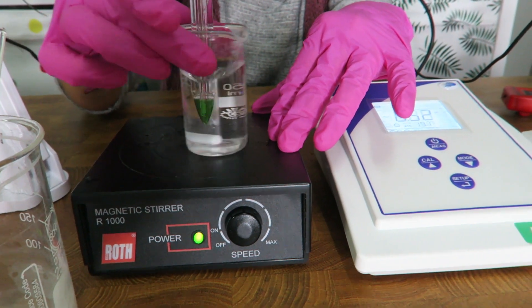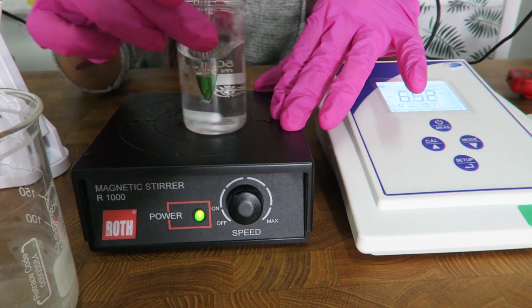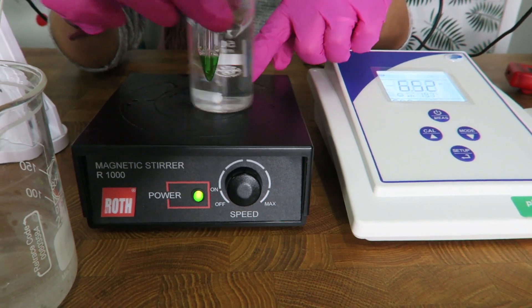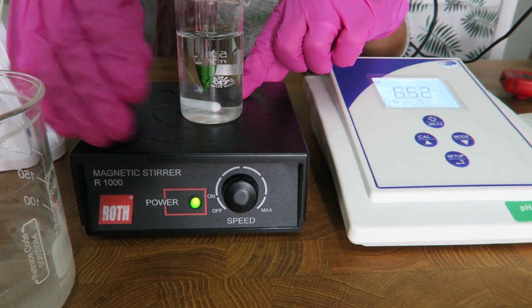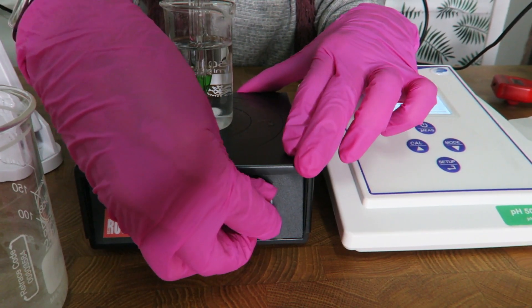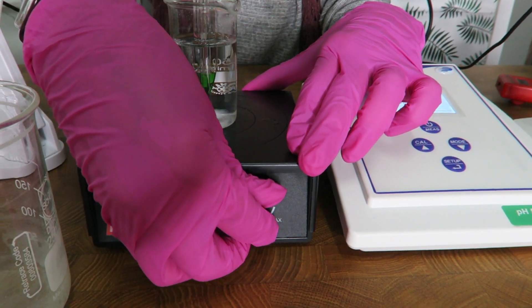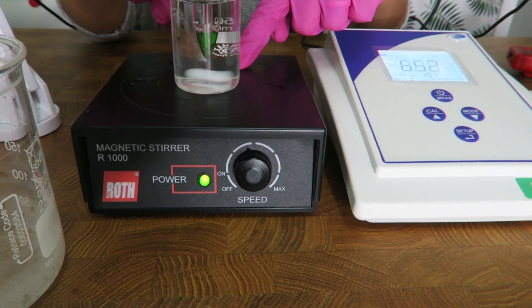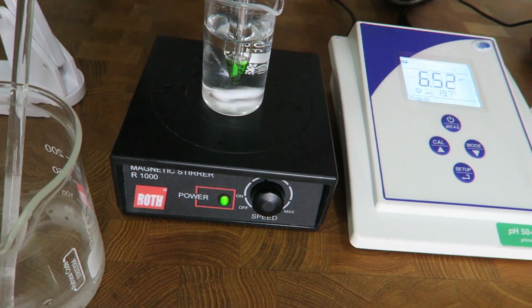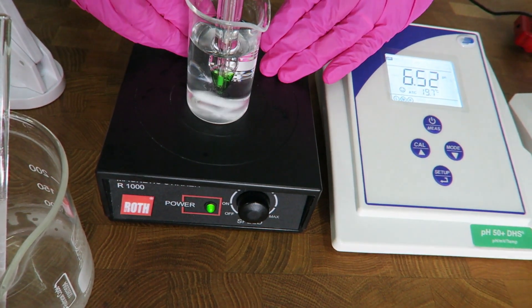Either you move the beaker gently to create the current for measurement — with the electrode not in contact with the bottom — or, if you want to make it easier, use a magnetic stirrer set on low. Keep distance between the electrode and the magnet so the electrode is not disturbed, but you can still create a current to measure the pH.